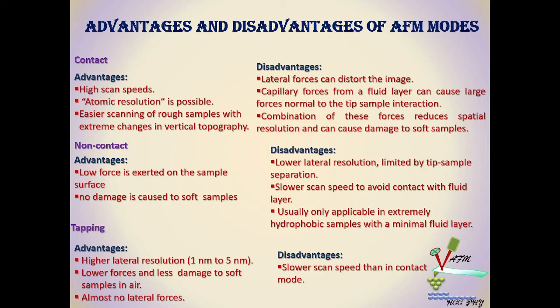But we cannot get as much high resolution as from the contact mode, but we can reduce the tip damage. And in the case of non-contact mode, it uses long range forces which are attractive, and these attractive forces occur at tip and sample surface distances of less than 10 nanometers.